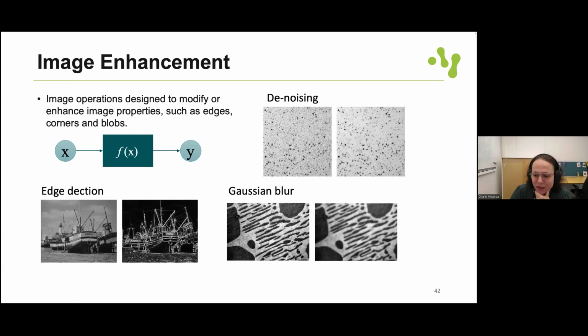And you may be wondering why I want to blur this image, why I want to apply this filter. We usually do this when we want to obtain a more homogeneous distribution of pixel values. This can help, for instance, in separating objects of interest. So in order to analyze that, we need to visualize the histogram of the image. That's why it's so important to understand how the intensity values are distributed.